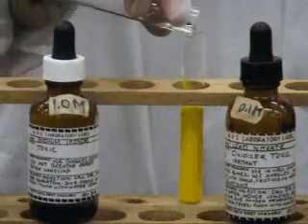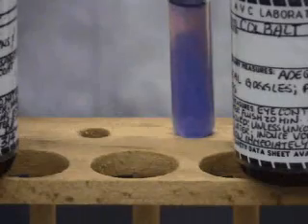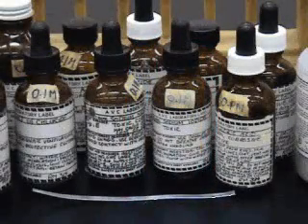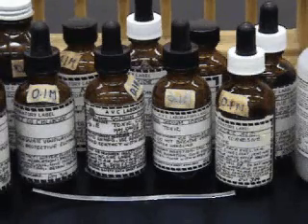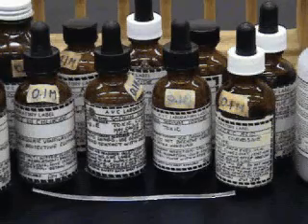The products formed in single and double replacement reactions may be predicted from the formulas of the reactants. In this lab, you will predict the products for 7 single or double replacement reactions. We will then perform those reactions and test your predictions.